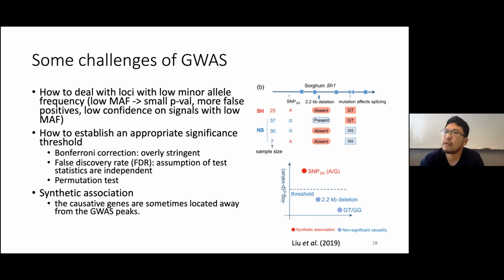So currently, for genome-wide association study, I've heard the opinion from some experts who recommend that you keep those markers with low minor allele frequencies and see if they appear in the final association.